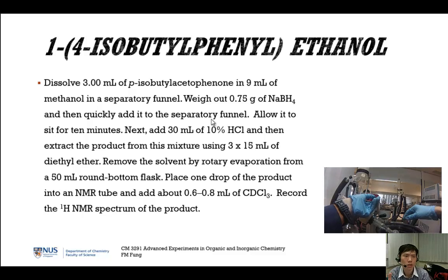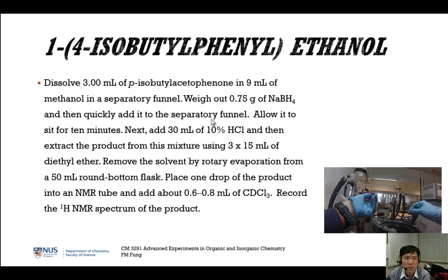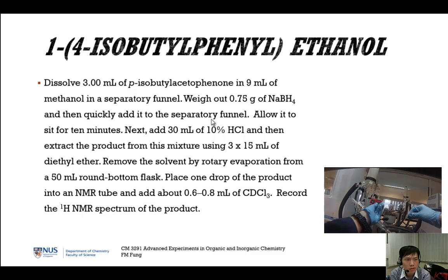So we are doing this reaction not in the traditional round bottom flask or conical flask. We can just do it inside the separatory funnel, because after that we're going to do some extraction, so we save time and effort, make it less cumbersome, don't have to transfer here and there, clean more glassware, and also you may lose some yield. And allow it to sit for 10 minutes.